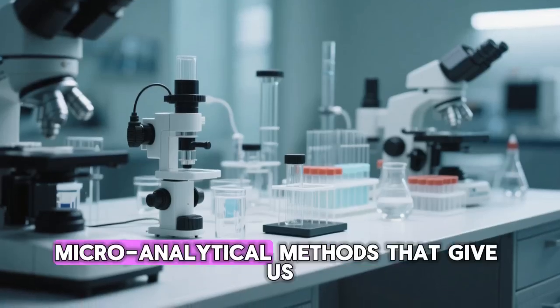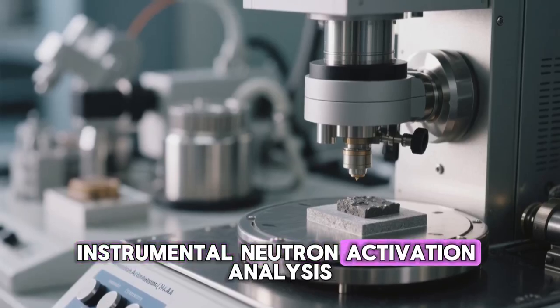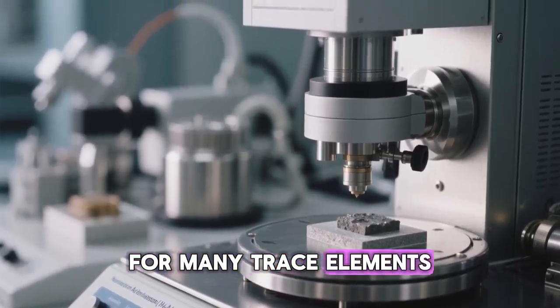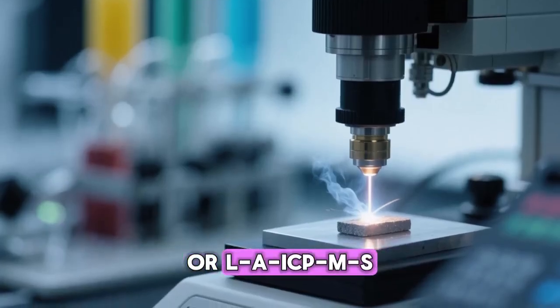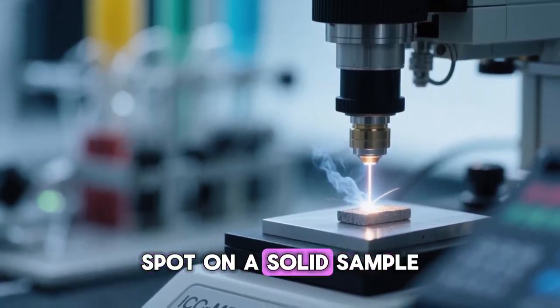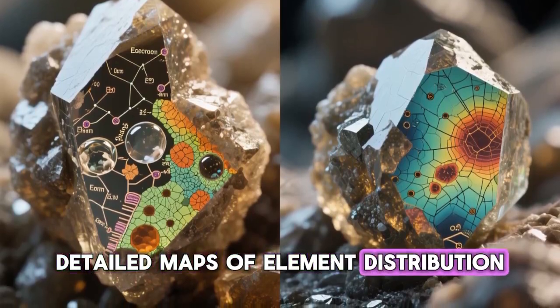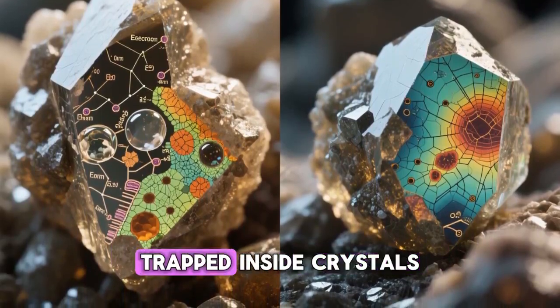Finally, we have a suite of micro-analytical methods that give us incredible detail. Instrumental neutron activation analysis, or INAA, is a non-destructive solid source method that is highly accurate for many trace elements and rare earth elements. Laser ablation ICP-MS, or LICP-MS, uses a laser to vaporize a microscopic spot on a solid sample, which is then analyzed by an ICP-MS. Its real power is in creating detailed maps of element distribution within mineral grains or analyzing the composition of tiny fluid inclusions trapped inside crystals.